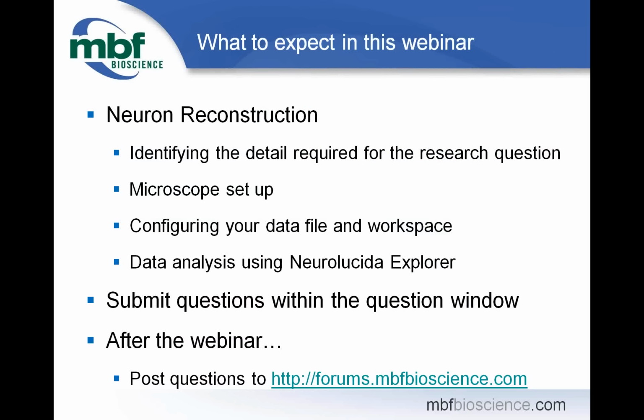We'll briefly touch on the equipment considerations for tracing at the microscope. This will include a discussion and demonstration of some of the features of Neurolucida to make this process of reconstruction flexible. Finally, I'll display some of the analyses available in the companion program to Neurolucida, Neurolucida Explorer.